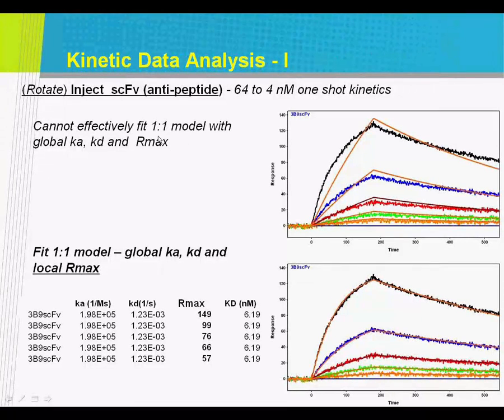In the second injection, you vary it. So after 6 injections, you would have injected each of these concentrations over a single spot. To a degree, it's like the old instruments, like the Biacore instrument and so on, where each concentration addresses a single spot.